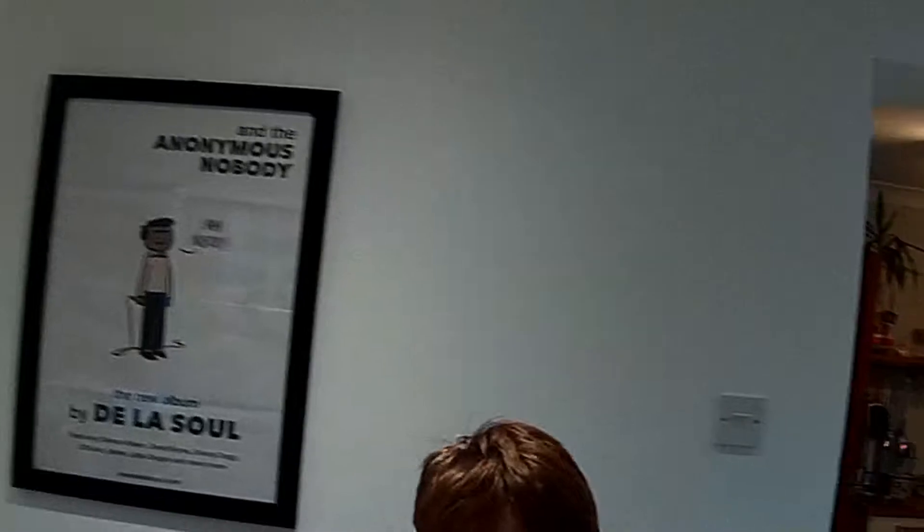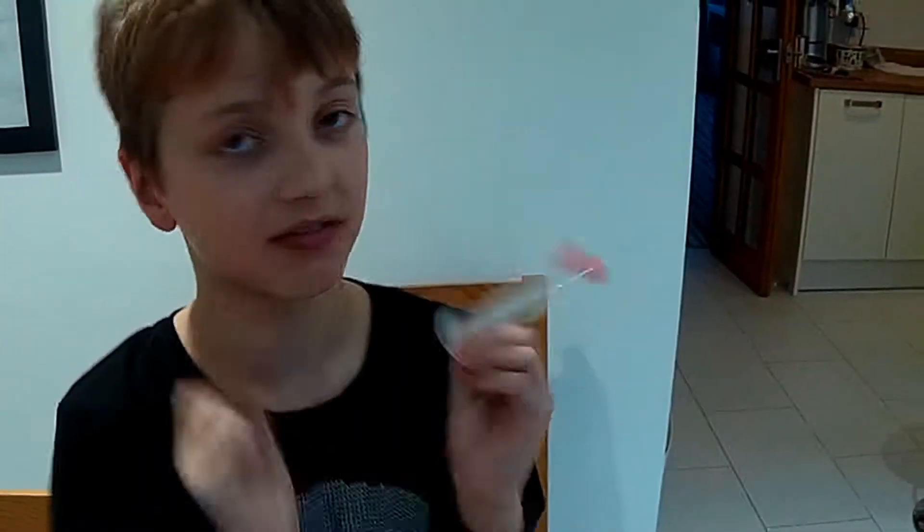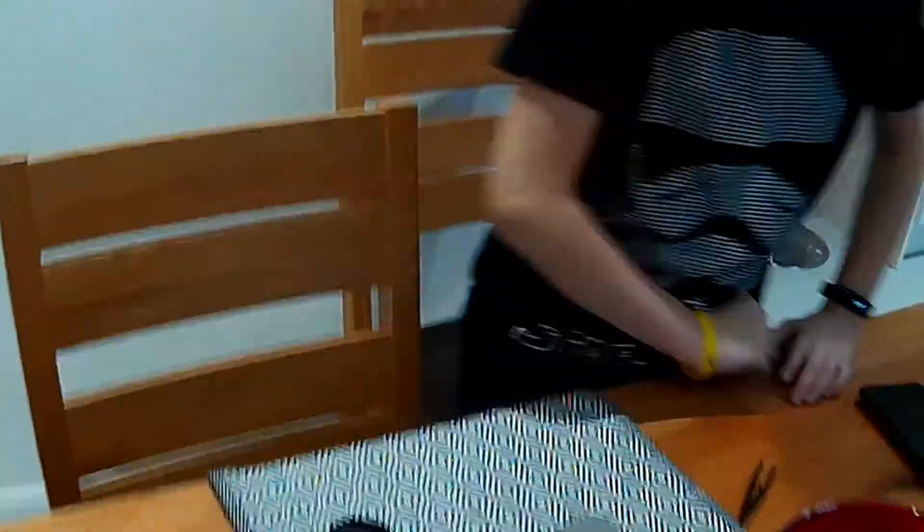We have a little flask — like a test tube. If you look real close, it's got a measurement gauge on the side so you can see how much liquid you have in your little flask, which is pretty cool. It also comes with a slicer — to chop up your fingers! It does come with a slicer. So what's that for? Slicing things.